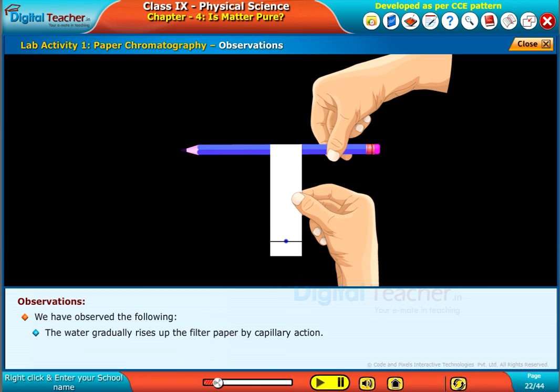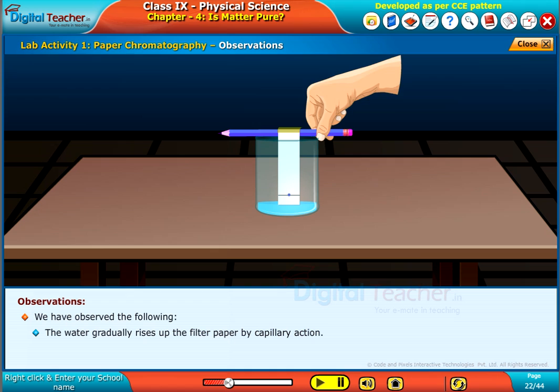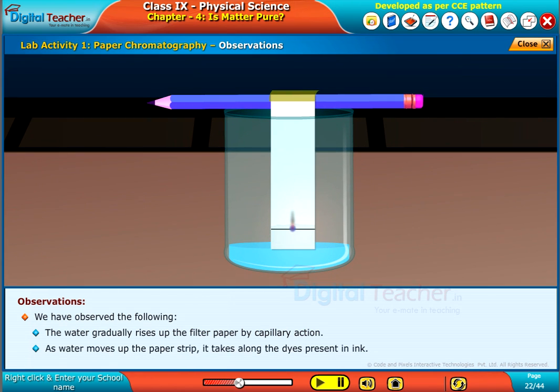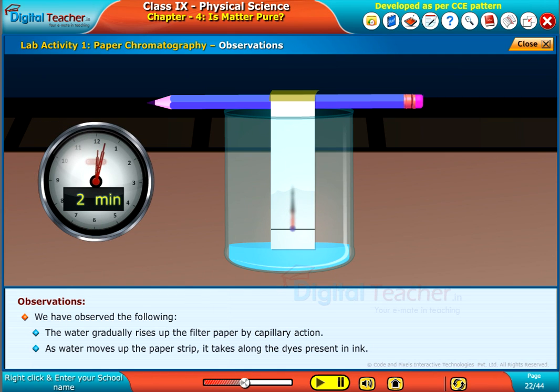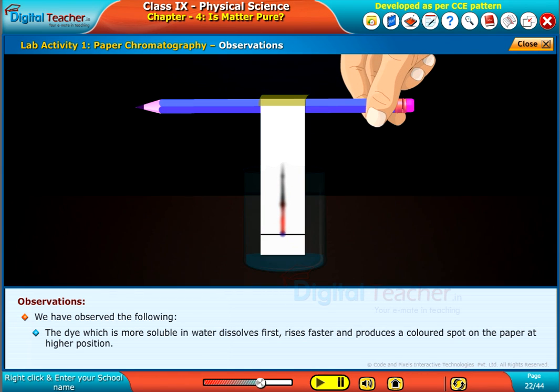The water gradually raises up the filter paper by capillary action. As water moves up the paper strip, it takes along the dyes present in ink. The dye, which is more soluble in water, dissolves first, rises faster, and produces a colored spot on the paper at higher position. The less soluble dyes dissolve a little later, rise slower, and form colored spots at some height on the paper.